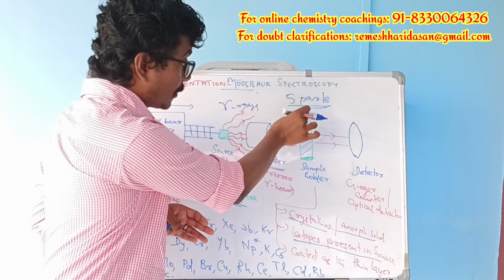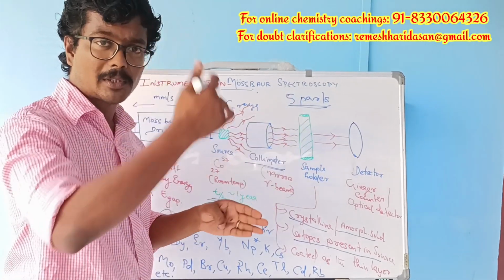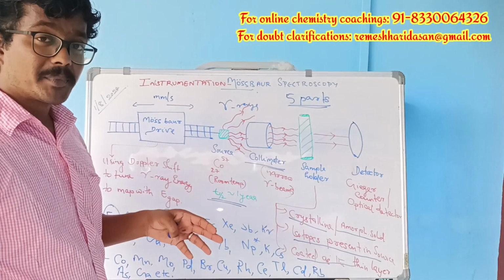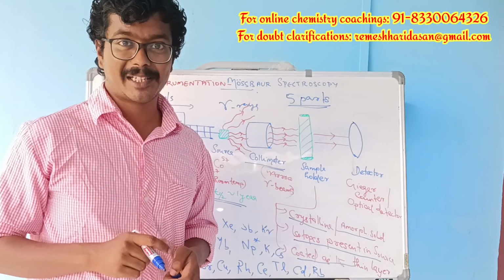And how is the sample coated? The sample is coated as a thin layer over the sample holder. Usually we require a larger quantity of sample, but it is non-destructive in nature.